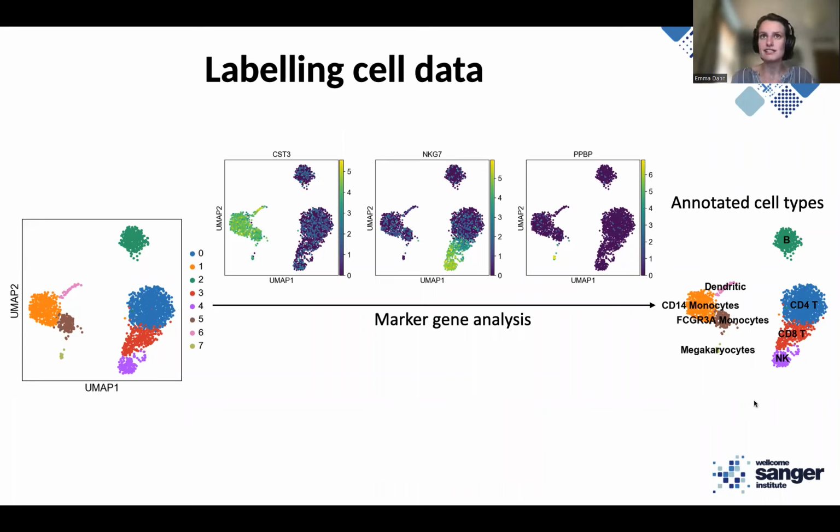In practice, this is a very time-consuming step for a lot of analysis tasks because there are a lot of systems for which we don't know the marker genes well, and we might identify a cluster that expresses a combination of marker genes that we've never seen before. There are actually examples of single-cell RNA-seq studies that, starting from this simple clustering approach and looking at marker genes, have identified a lot of new or rare cell types that we didn't know existed.